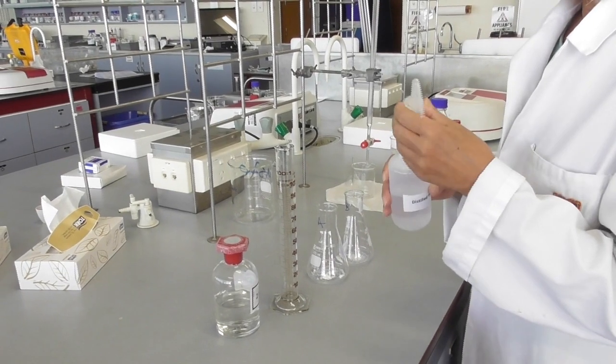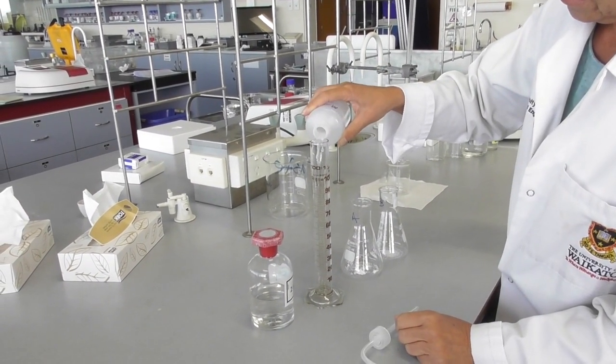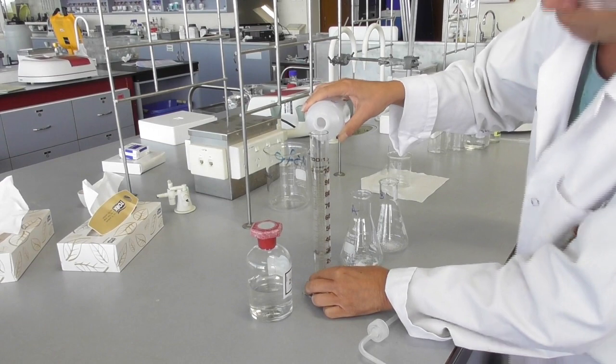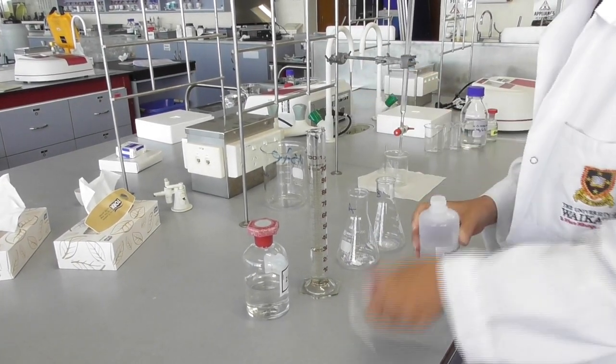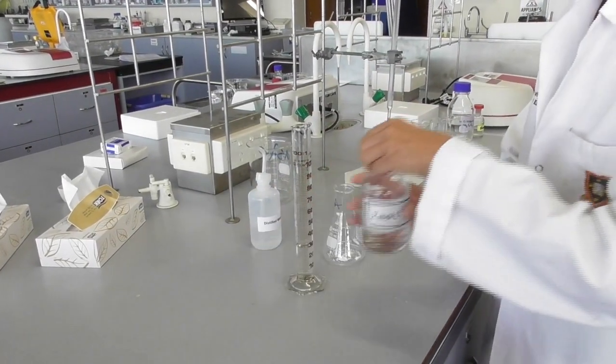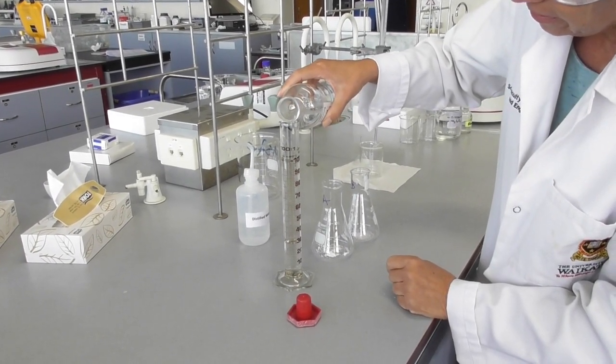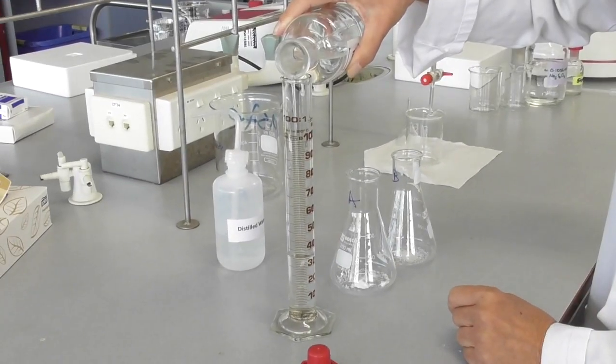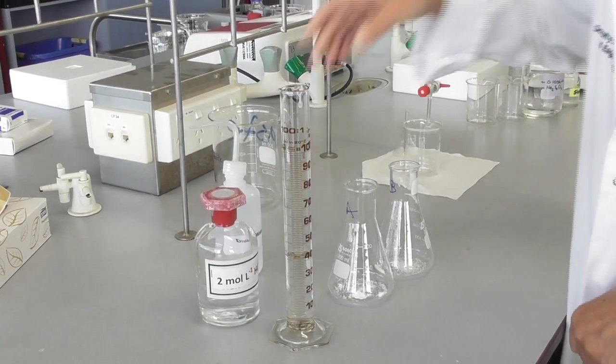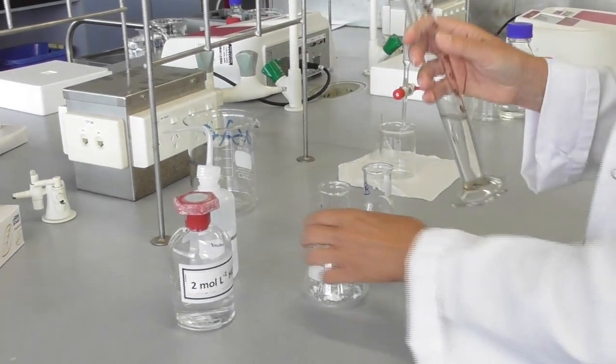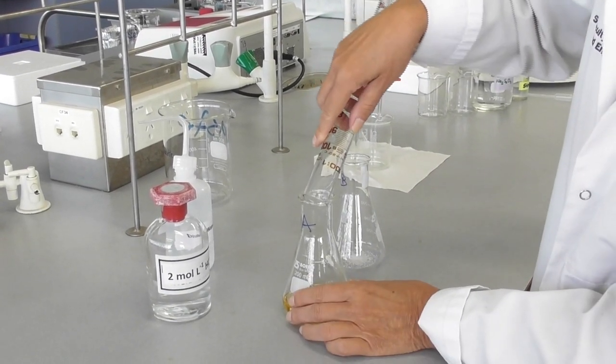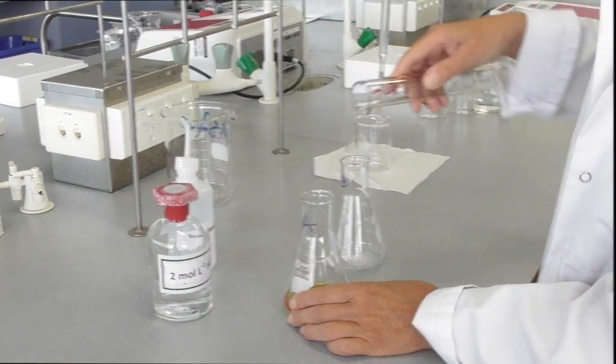Once I have added potassium iodide to both flasks, I prepare the acidic solution. I add 30 ml of distilled water into a graduated cylinder, and I add 10 ml of 2 molar hydrochloric acid to the water into the cylinder, so that I have 40 ml of somewhat diluted hydrochloric acid. I add this to the first flask and repeat the same for the second flask.